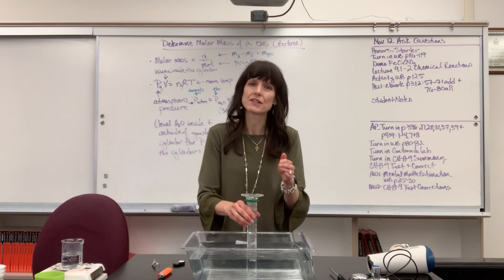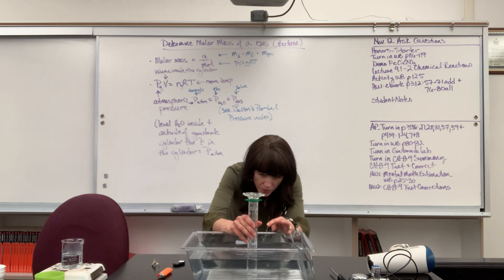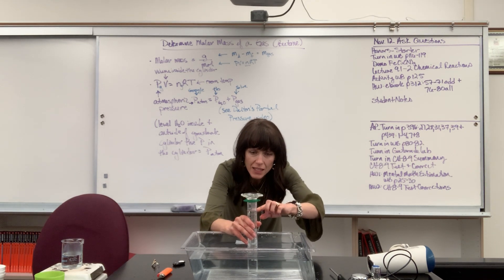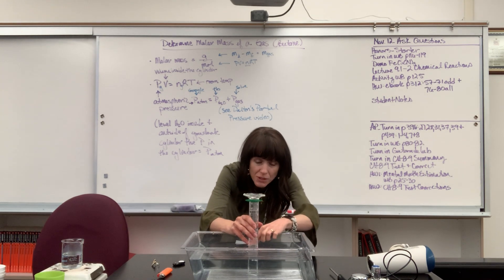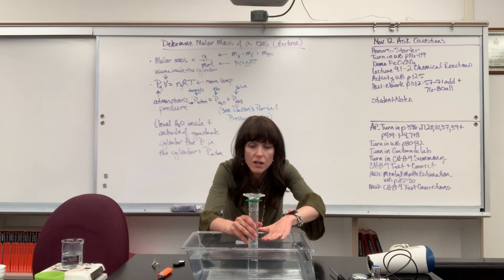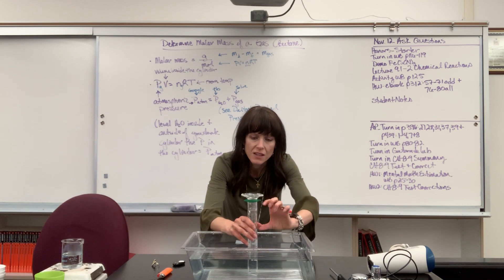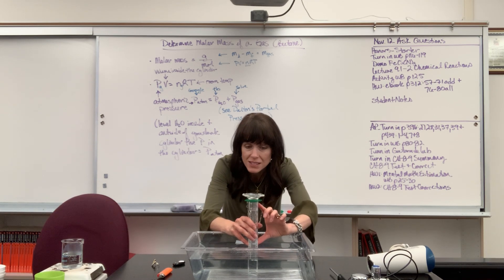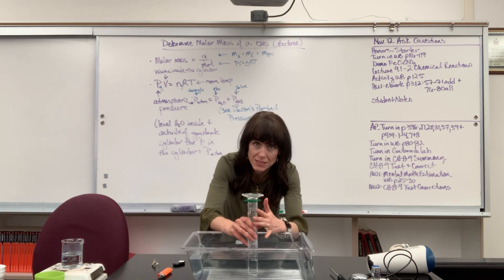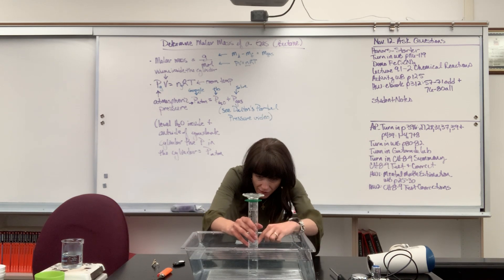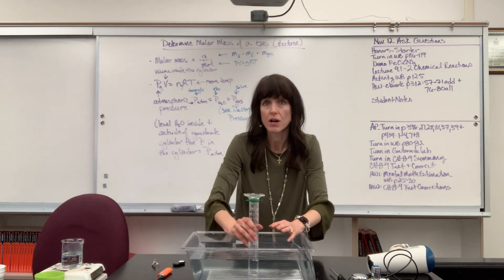Once you fill this with gas, here's the really important part: you need to adjust this graduated cylinder up and down so that the level of the water in the graduated cylinder is flush with the level of the water in the container. When you do that, you've confirmed that the atmospheric pressure equals the pressure inside that graduated cylinder. Get those levels matched, look at the reading, and record your volume — there's your V.